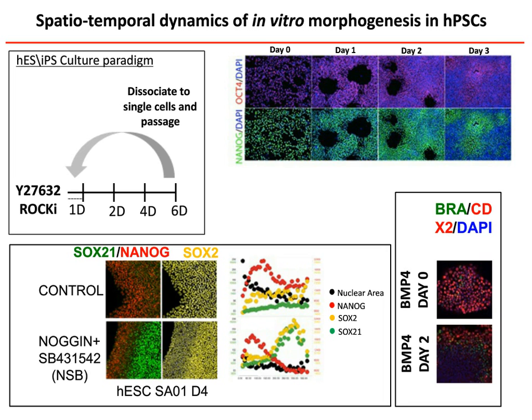And if you compare the top panels to the lower panels, it's completely clear that there's an elevation of SOX21 in green, not at the colony edge, but away from the colony edge. Likewise with SOX2.